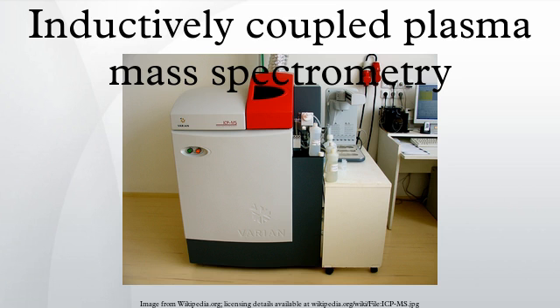Mass spectrometry. For coupling to mass spectrometry, the ions from the plasma are extracted through a series of cones into a mass spectrometer, usually a quadrupole. The ions are separated on the basis of their mass-to-charge ratio and a detector receives an ion signal proportional to the concentration. The concentration of a sample can be determined through calibration with certified reference material such as single or multi-element reference standards.